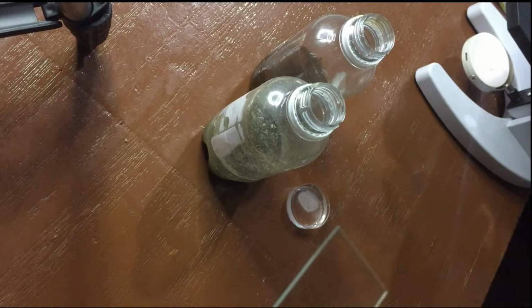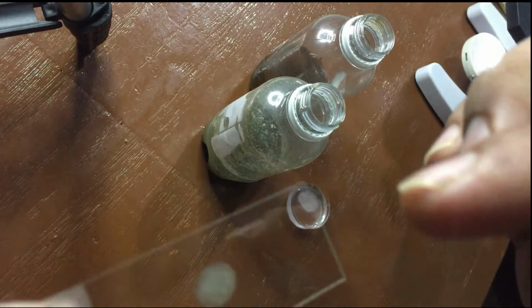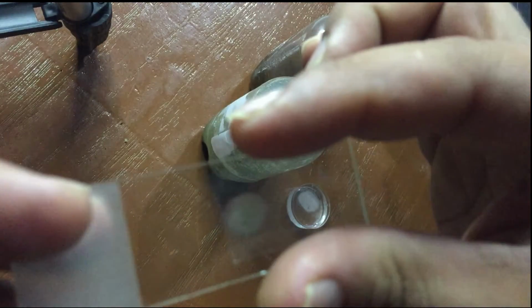First, we will start from river water. As you can see, so many bacteria moving around.